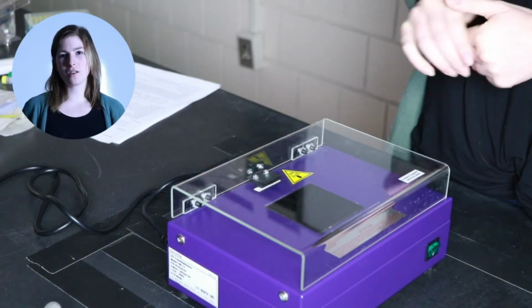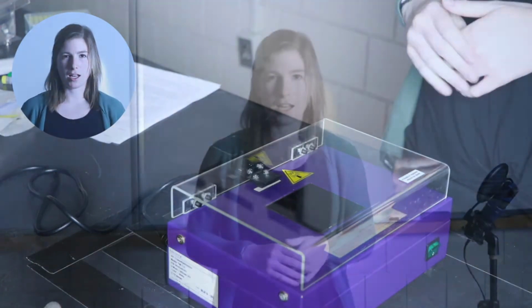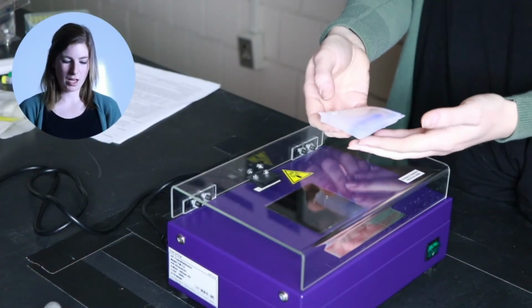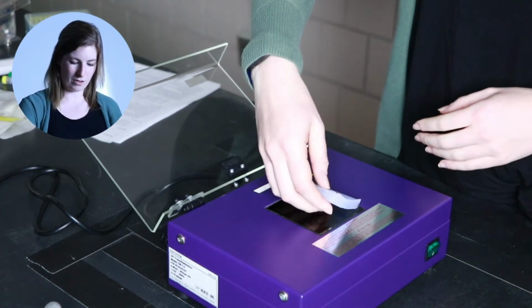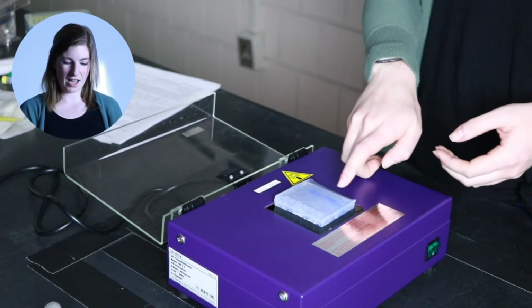All right, so now that we've let our gel run for about 35 or 40 minutes, I've taken it out, and so now I just have this gel outside of all of the plastic pieces that we started with. And what you should hopefully be able to see, but if you can't too well, I'll just tell you what I'm looking at, is it feels like a gel and I have purple bands at the bottom here.